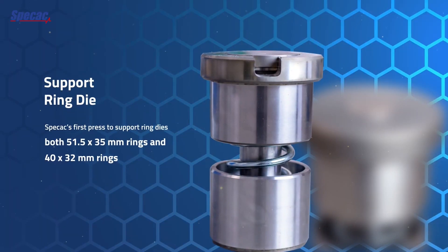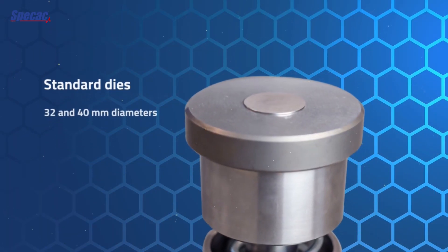One of the principal new features of the APEX 400 press is the ability to press using ring dies, which significantly increases speed. The main requirements in these industries are really speed and robustness.